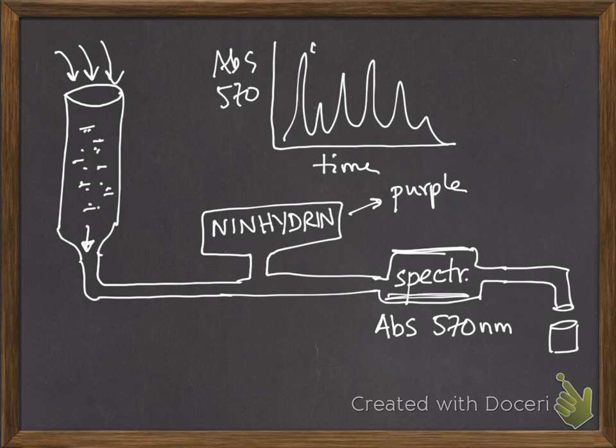So how you know which peak is what is a great question, and I decided to reveal that to you at the end of my explanation, but I could have also started off with this because this is actually what you would probably do before you run your sample of your hydrolyzed protein. You do your standards. So you run some standards. So you do the same exact setup.